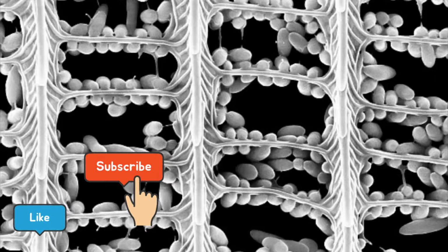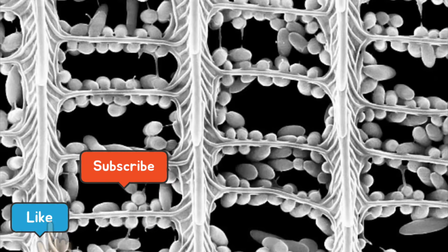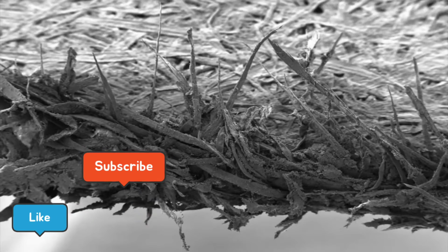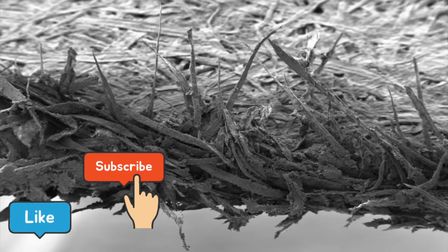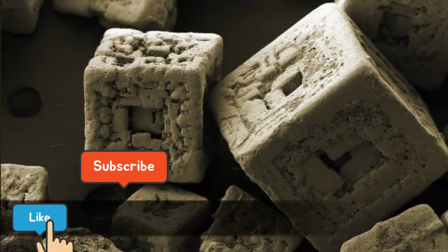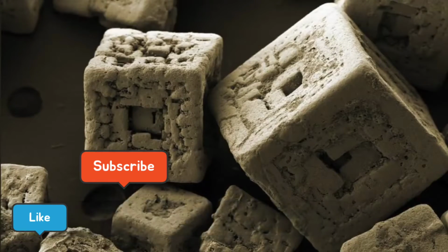In this tiny section from the wing scale, we can see that the vertical ribs are connected by tiny rods, each covered with spore-like protuberances. The edge of a plain piece of paper. These are grains of salt, a mineral composed primarily of sodium chloride, essential for life in general as well as being one of the basic human tastes.